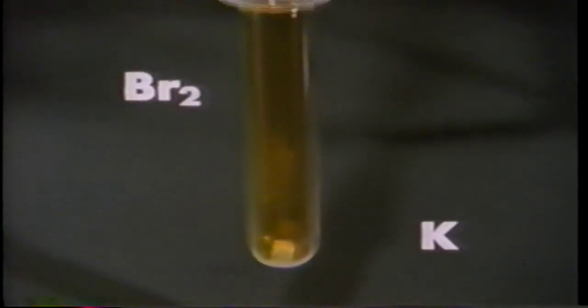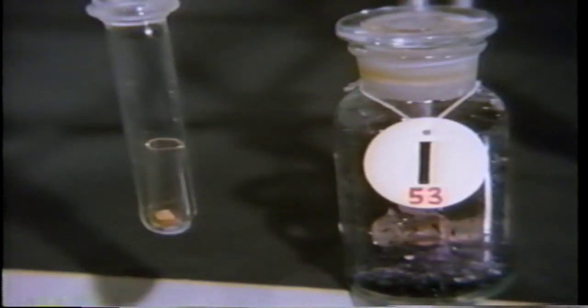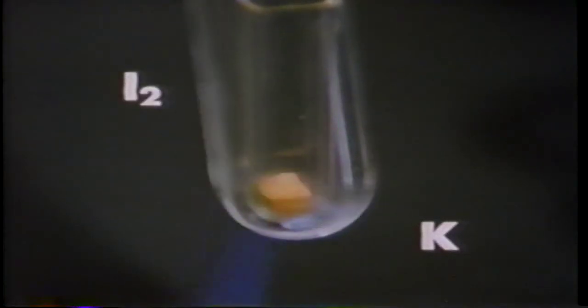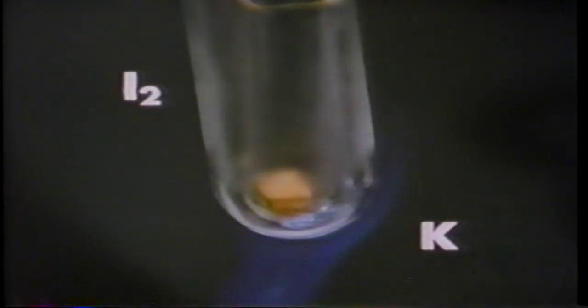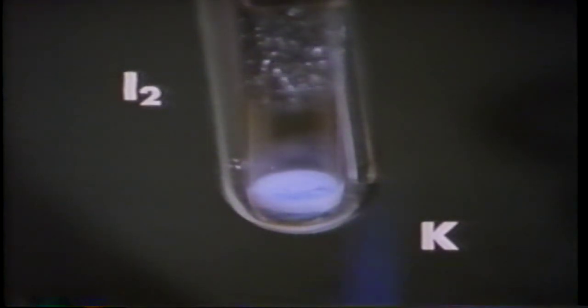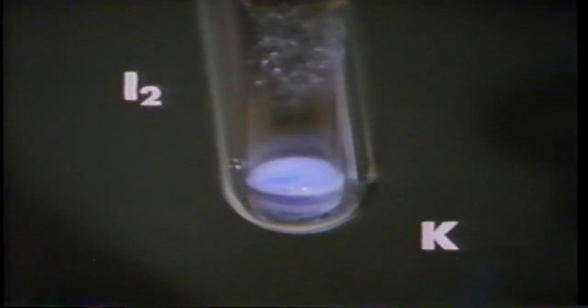First, we try bromine gas. Once the heating breaks the crust on the potassium, reaction starts. Solid potassium bromide forms. Since both iodine and potassium are solid, we have placed the potassium in the inner tube and iodine in the outer tube. Heating gives gaseous iodine.